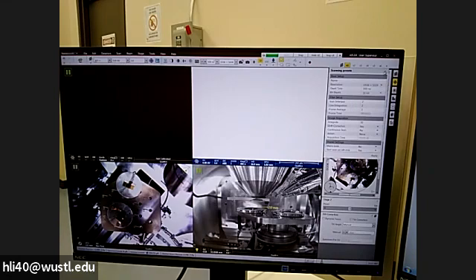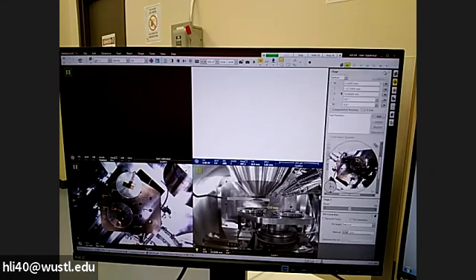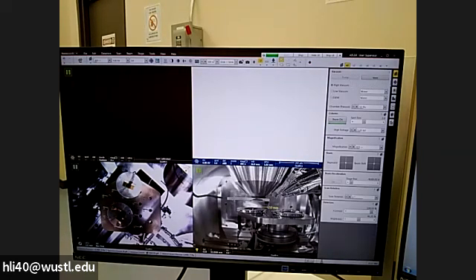All right, so this is the software. On the right side, we have a list of buttons. In the first button, when we start, we see it has a vacuum interface and a column. Here you can also set up the kV and spot size, and there is a beam on button. We will come back to this.